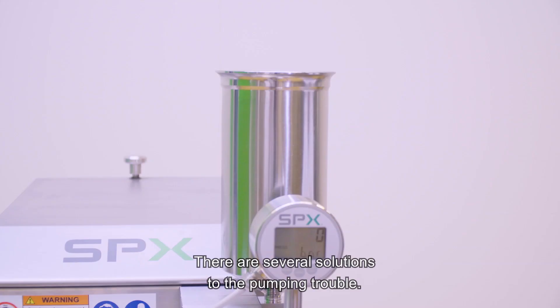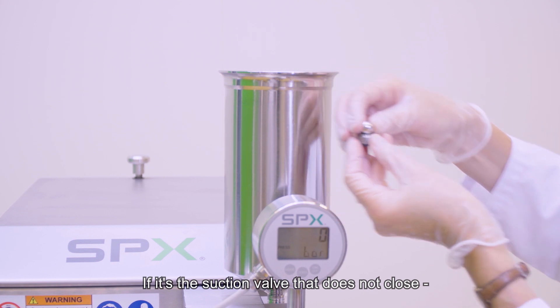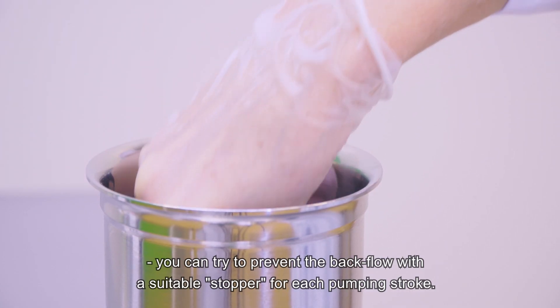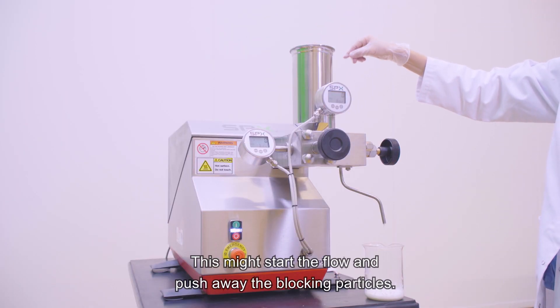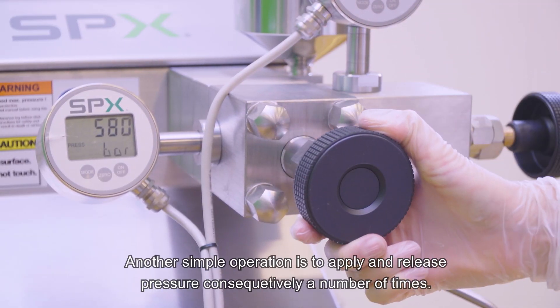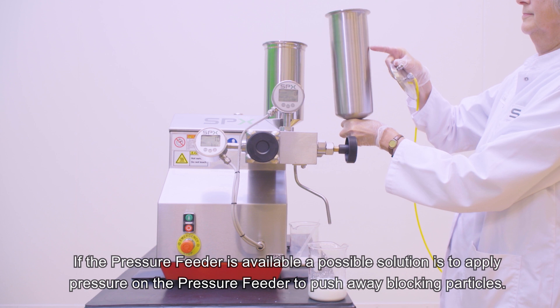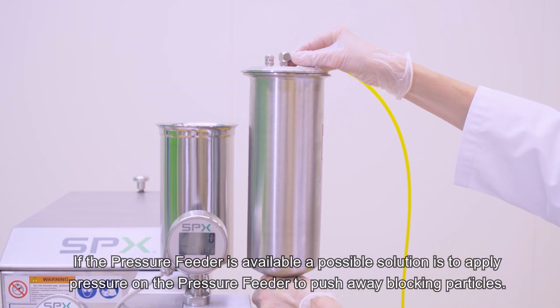There are several solutions to the pumping trouble. If it's the suction valve that does not close, which you observe by backflow visible in the pressure feeder, you can try to prevent the backflow with a suitable stopper for each pumping stroke. This might start the flow and push away the blocking particles. Another simple operation is to apply and release pressure consecutively a number of times. If the pressure feeder is available, a possible solution is to apply pressure on the pressure feeder to push away blocking particles.